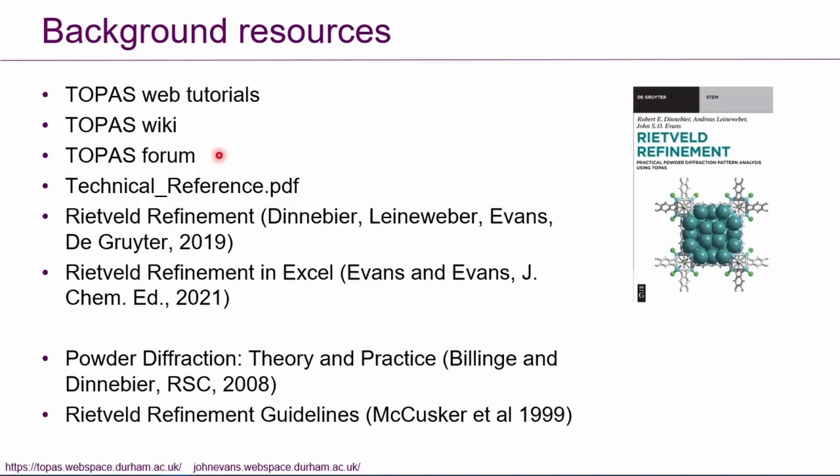And there's also a link to the TOPAS forum where you can ask questions about TOPAS, and hopefully one of the experts from around the world will answer those questions. I really recommend you read this document here. If you look in your main TOPAS directory, there's a file called technicalreference.pdf, and that's written by Alan Coelho, and it's got details of all the functionality of TOPAS and the mathematics of how TOPAS works. So you should really try and read that document.